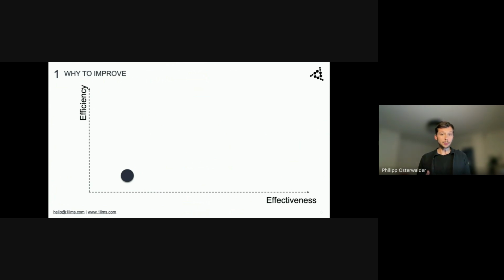And our approach, and always my answer, is that it's very, very important to think of the processes first that you want to digitalize. Think of the process as a step-by-step framework.